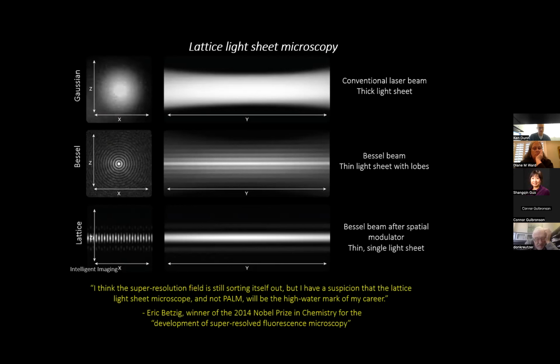The reason it's important, and this is interesting, if none of you have seen it, I recommend watching Eric Betzig's acceptance of the Nobel Prize. Eric Betzig's the guy who invented this. Eric Betzig is also the guy who discovered spatially varying forms of super resolution microscopy. But he's always been incredibly dismissive of his work with super resolution microscopy.